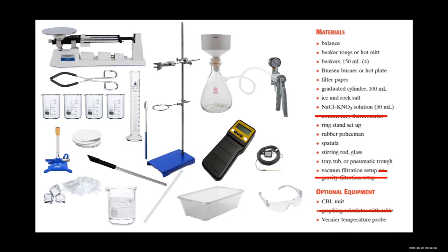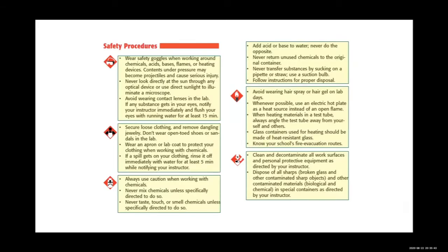Don't forget your eye protection. This is also a lab where you may want to consider an apron and gloves. Safety procedures. We will need to pay close attention to all of the various safety procedures for this lab.